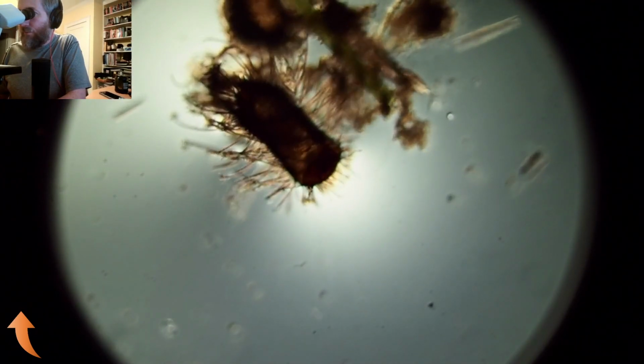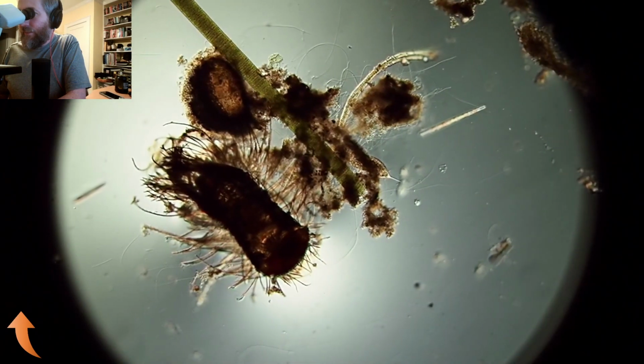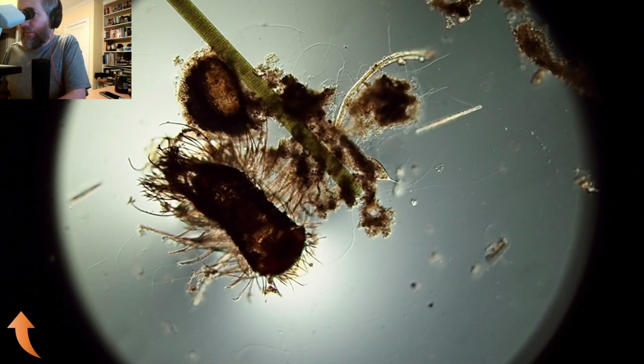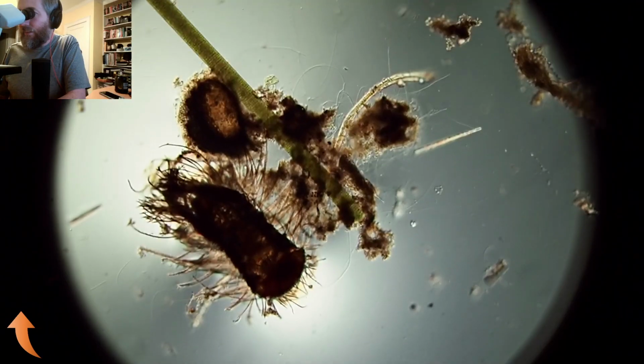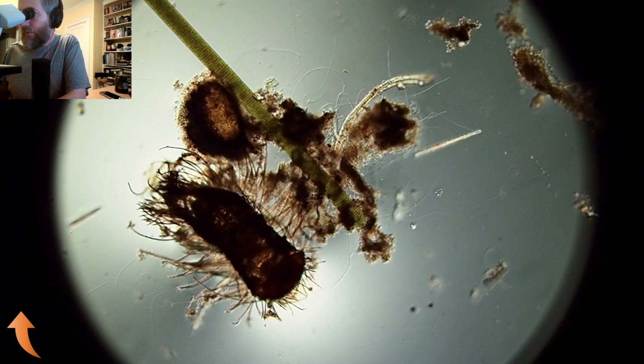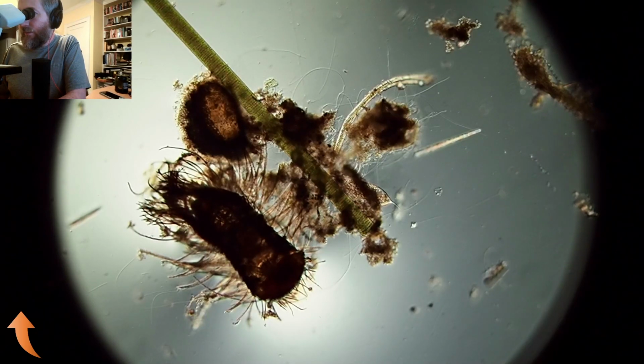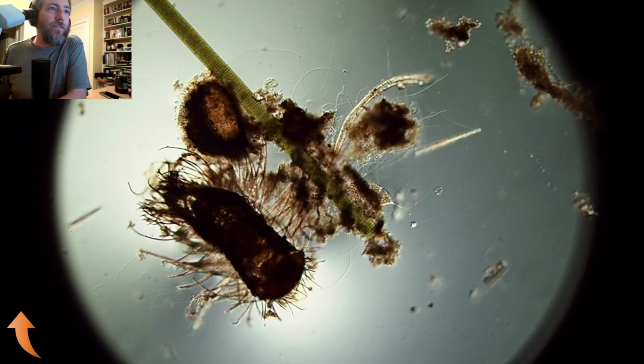That is the home of something. And that looks like a Euglena we're seeing right there. Like the tail end of it. Positive about that though. Got a long spindly head. Oh, maybe it's another Dileptus? Oh, one of those.